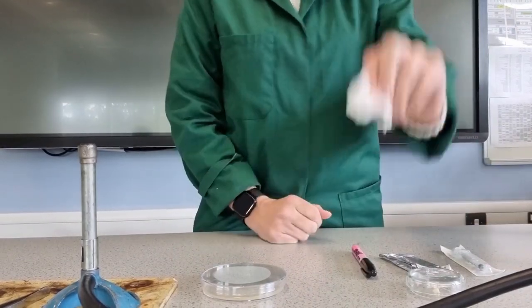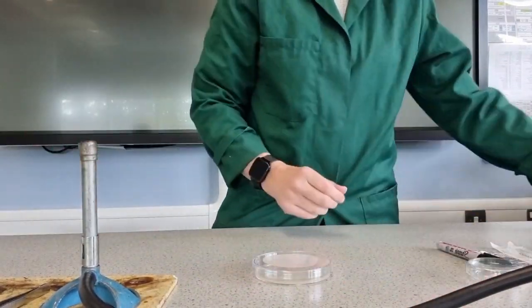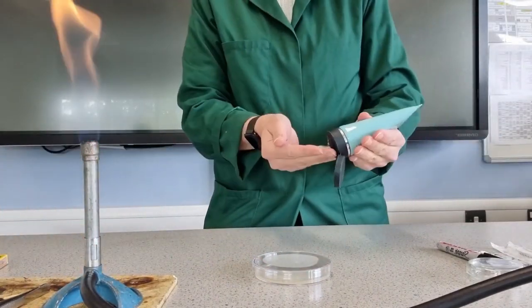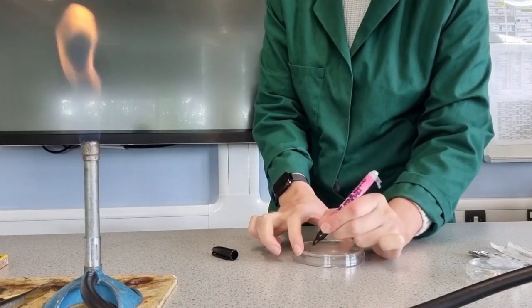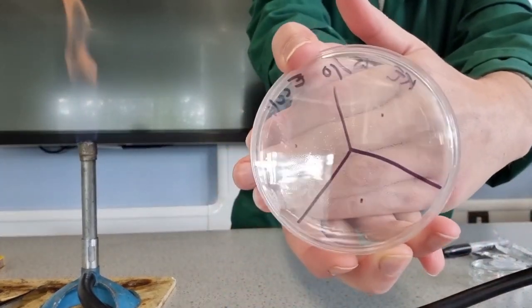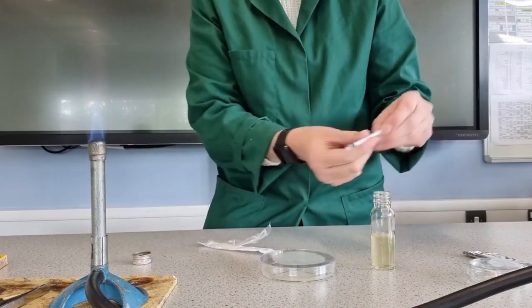So let's watch the method then. First of all, you disinfect your work surface. Then we're going to light the Bunsen burner. I've washed my hands there with an antiseptic and antibacterial gel, and then labelling the petri dish with my initials, the date and E. coli, because that's the bacteria I'm growing. I also split it into three so that we can see where to place the discs.